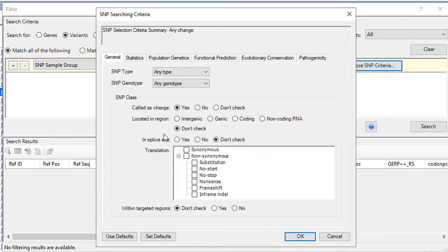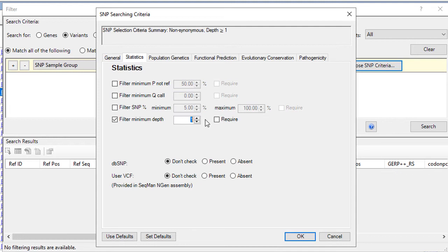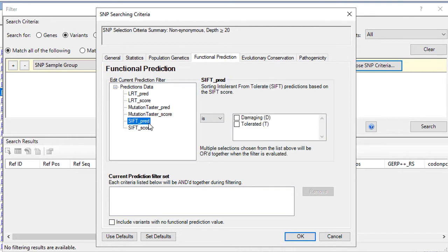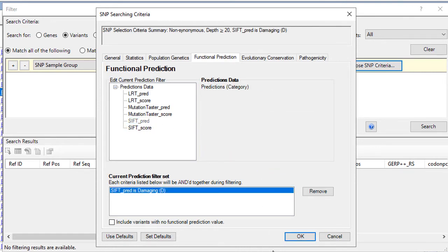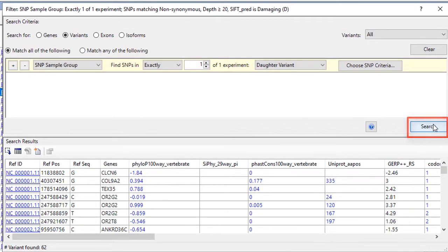Here we'll set the SNP translation to non-synonymous, and I'm going to set a minimum depth of 20. Then in functional prediction, we'll set the SIFS score to damaging and add that filter to our set. Once you're satisfied with your filtering criteria, click search.